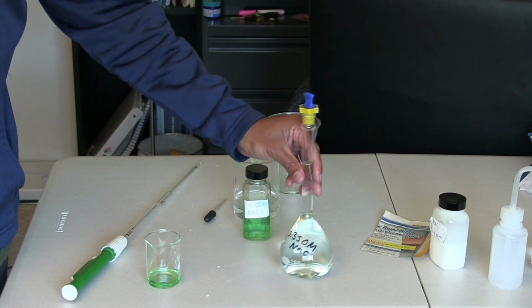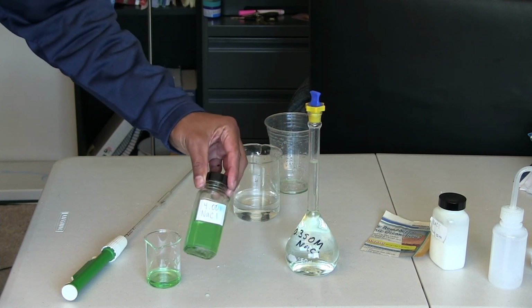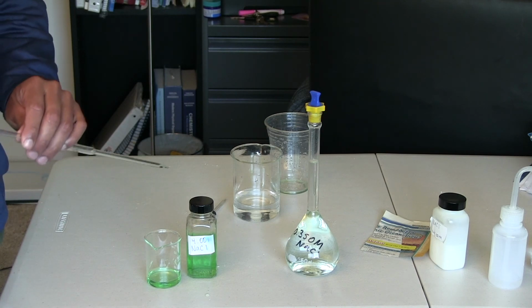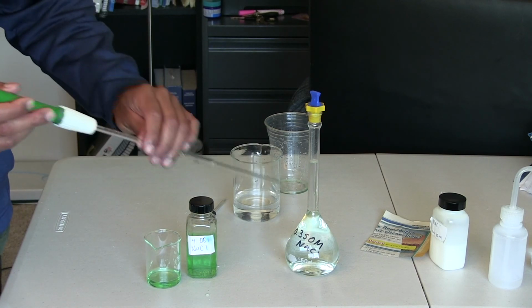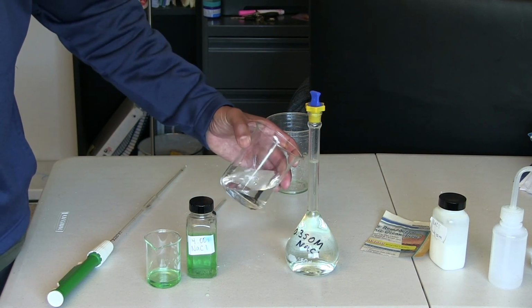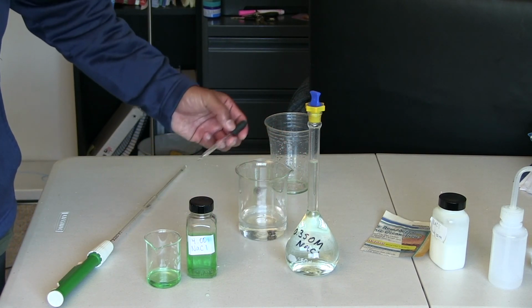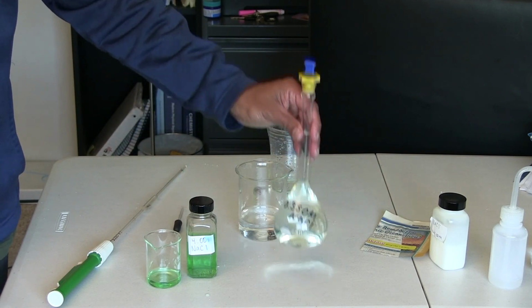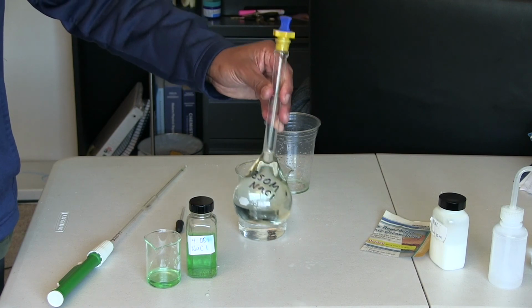Okay, so to summarize, I took some of the stock. Using a volumetric pipette and pipette filler, I transferred some of the stock into the flask. I added some distilled water, I swirled it, and then filled it with some distilled water. To make sure the meniscus touches the mark, I used a medicine dropper, and then I invert it and label the flask. And there you go.